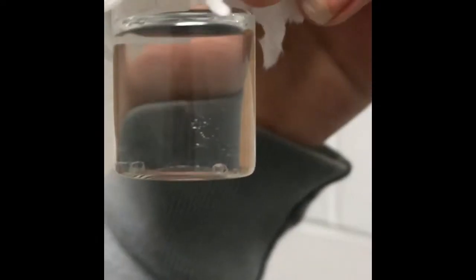And here is a better look at the little crystals in the vial. As you can see, they're very small, and they're in the corners of the vial, not built up too much yet, and not that many.